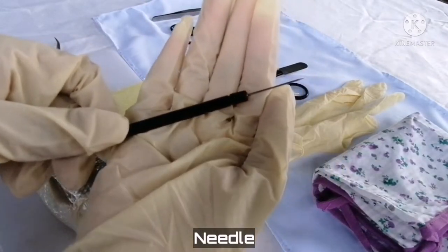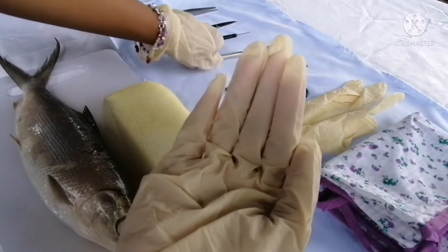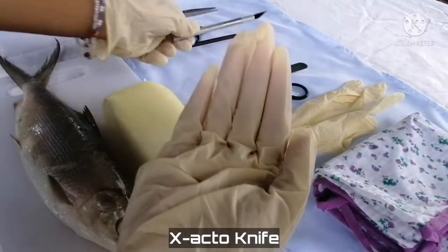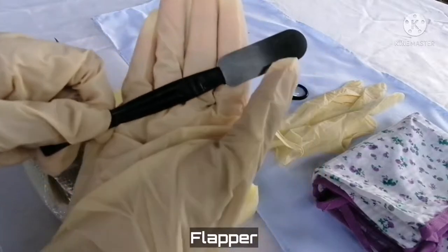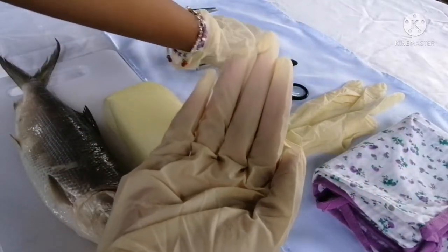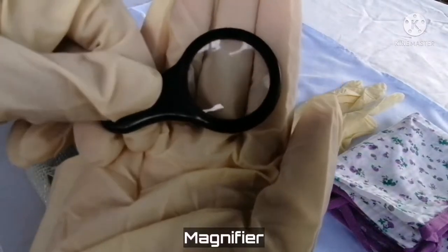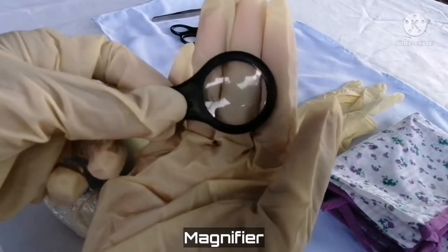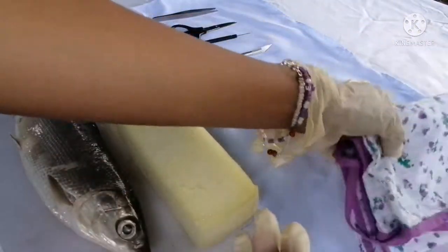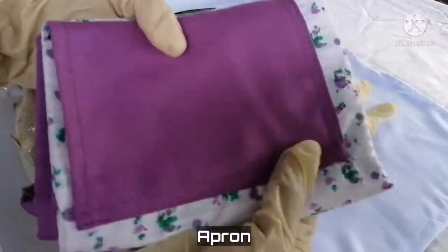needle, X-acto knife, flapper, magnifier, surgical gloves, and last is apron.